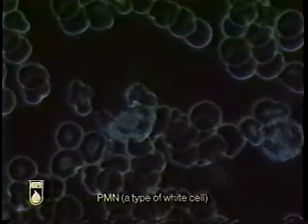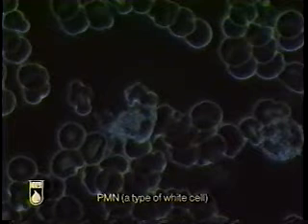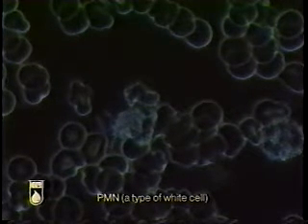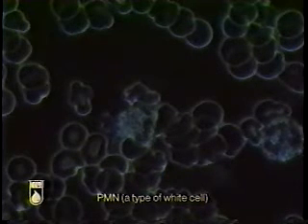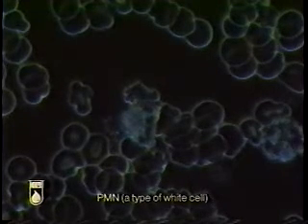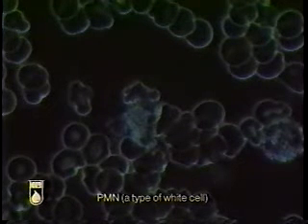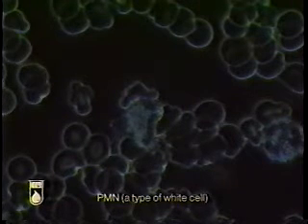The cell near the center of the field here is a polymorphonuclear neutrophil, or a PMN or SEG for short. We note that this particular kind of cell is responsible for the direct attack and phagocytosis of foreign material that comes into our body. It's peculiar in that the nucleus is made up of multiple lobes. The cytoplasm or soup of the cell contains numerous bright granules. We note that they're in motion.